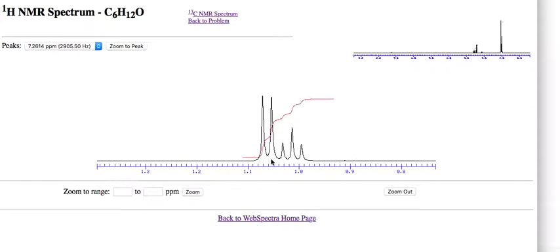So we've got 6 hydrogens split into a doublet, meaning being split by 1 hydrogen. And if you recall, this peak, of course, has got 1 hydrogen. So it's highly likely to me that this 1 hydrogen peak and this 6 hydrogen peak are connected to one another, and we've seen that signature before. The 6 hydrogen peak being split into a doublet, the 1 hydrogen peak being split into a multiplet.